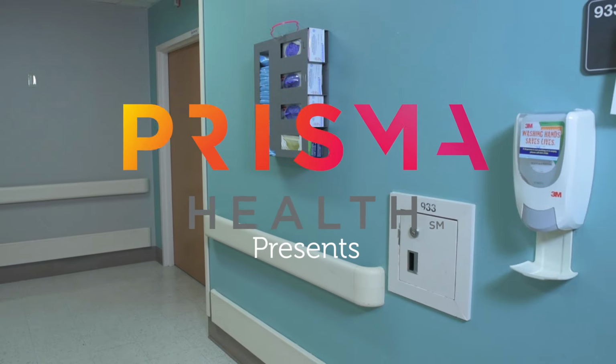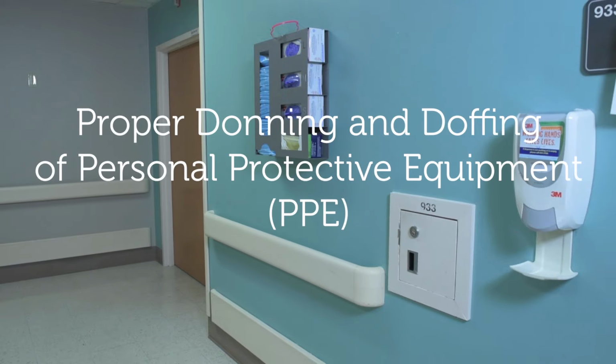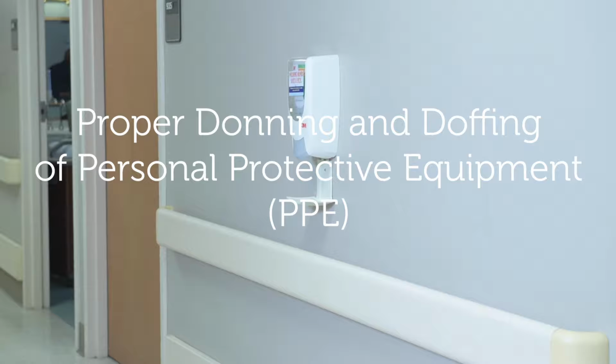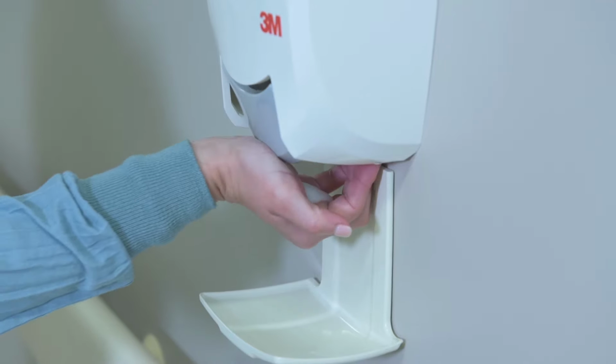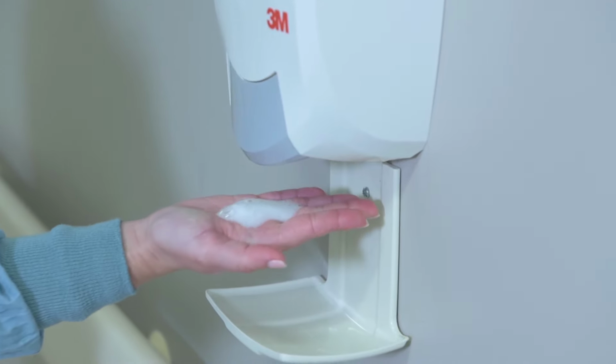This video will cover the correct way to put on, or don, and remove, or doff, personal protective equipment, or PPE. PPE provides protection from body fluids and infection. PPE is selected according to the ordered precautions and type of patient care you are preparing to perform. Not all PPE will be needed for all types of precautions.